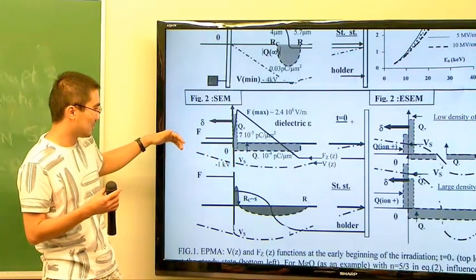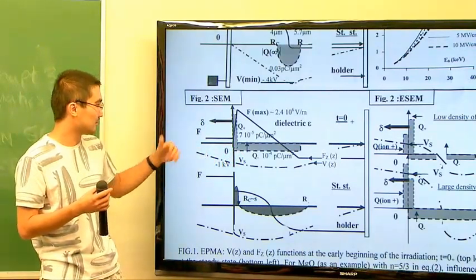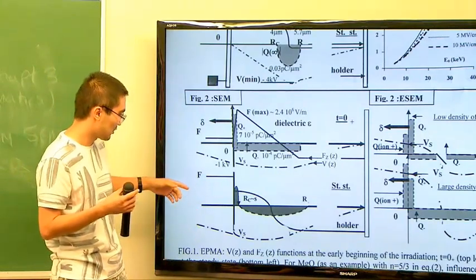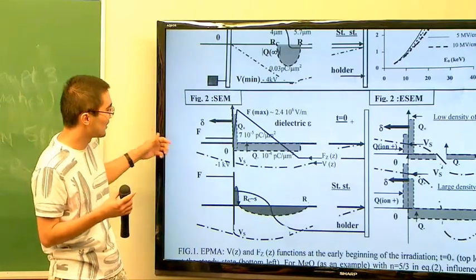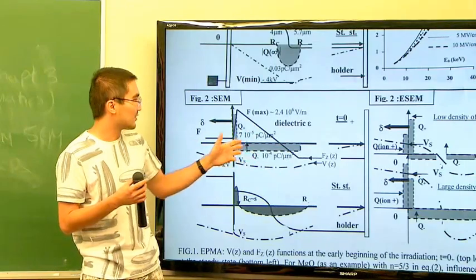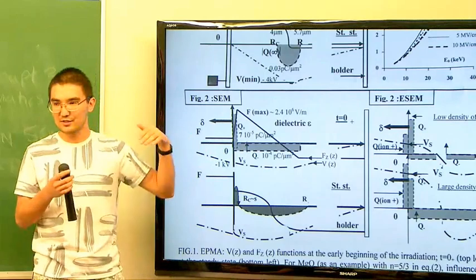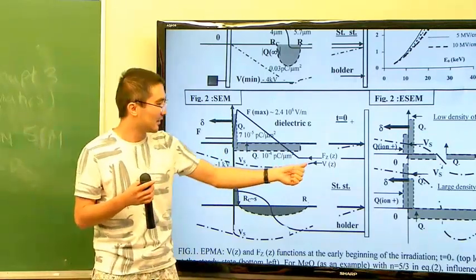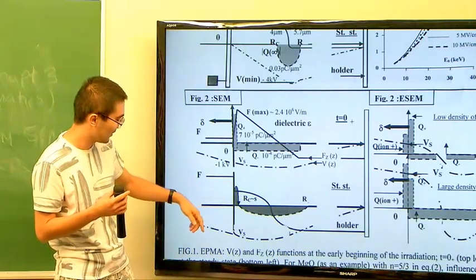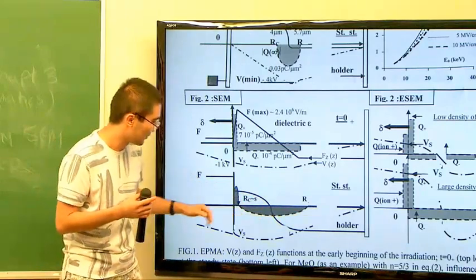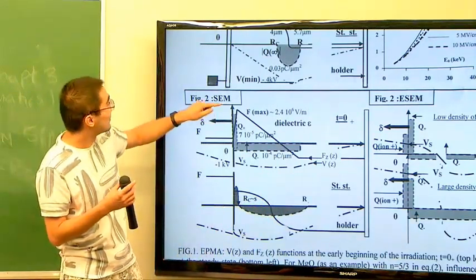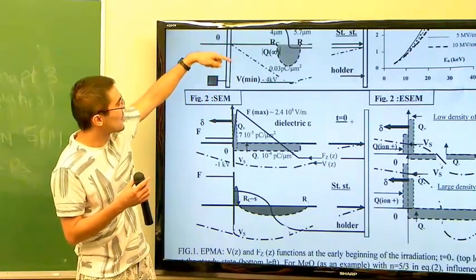Because of that positive charge, it slows down the electrons and you cannot image well at that point. As time passes, positive charges start to build up at the surface and after some point you kind of achieve steady state — the electric field can no longer increase. It basically stabilizes, and you have positive charges on the surface and negative charges deep into the bulk of the sample.